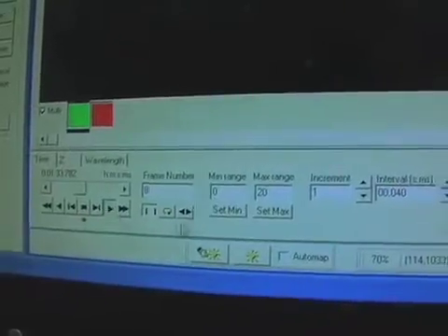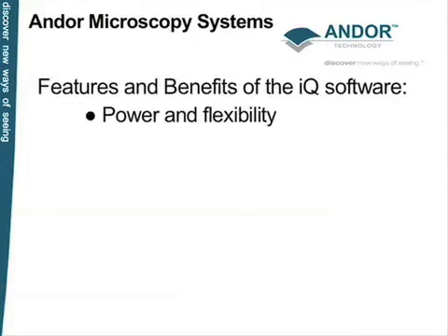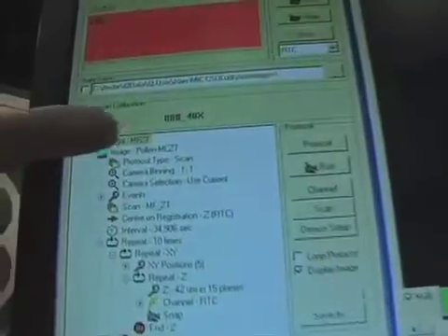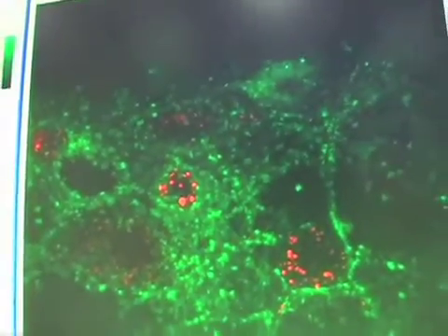There's also software going on here — AndorIQ — which comes with the system and supports all of the instrumentation you've seen. It's been built up over 15 years and supports an enormously wide range of hardware, with more being added all the time. Our goal is to create an open environment for the user to select which hardware components they have from legacy systems or are buying new, and to package it all together so it works seamlessly under AndorIQ.